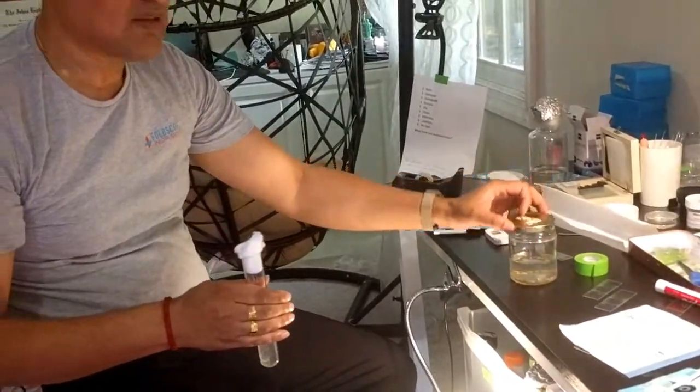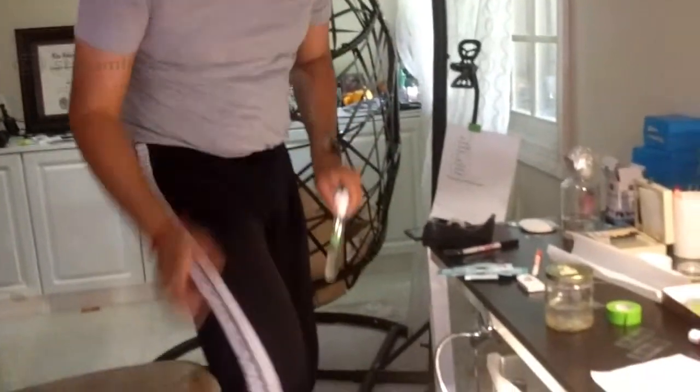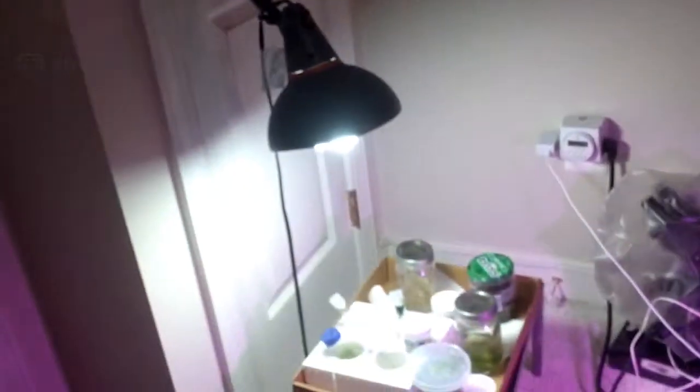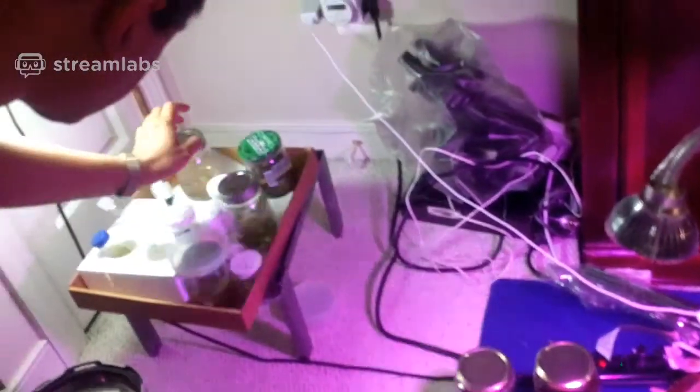That's it. Let it be. This is how you maintain cultures. Very easy. Wheat grains and plain water. Now, there are some organisms that you don't even need to go that far. Look here, I have so many bottles. This is just pond water. Good old pond water. Stuff growing in it, which is great fun.